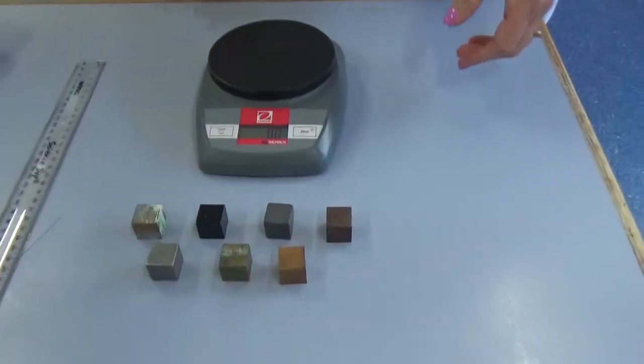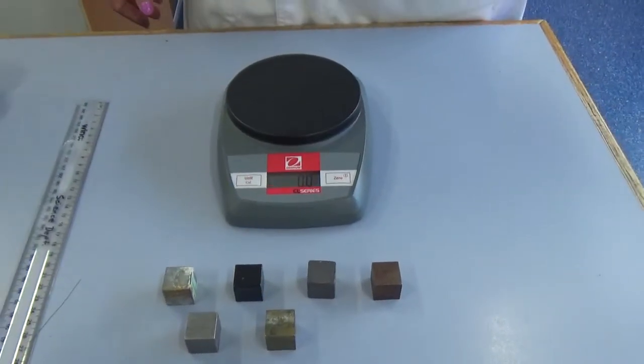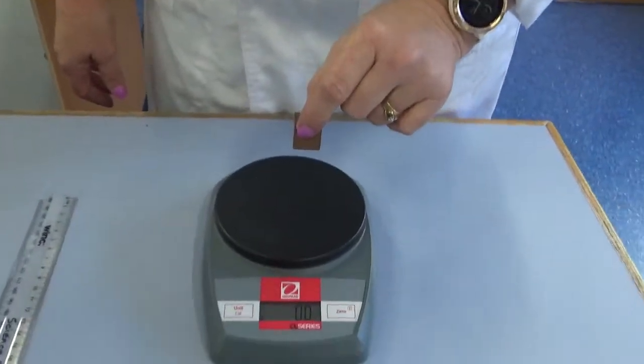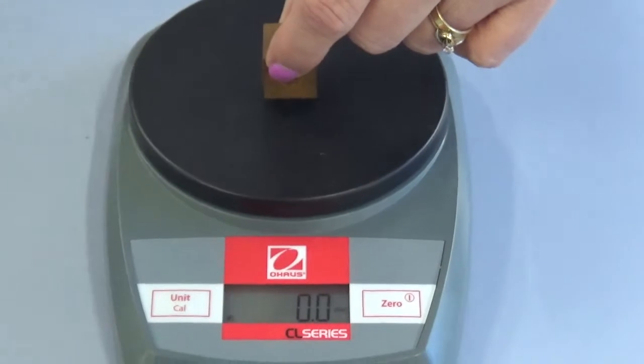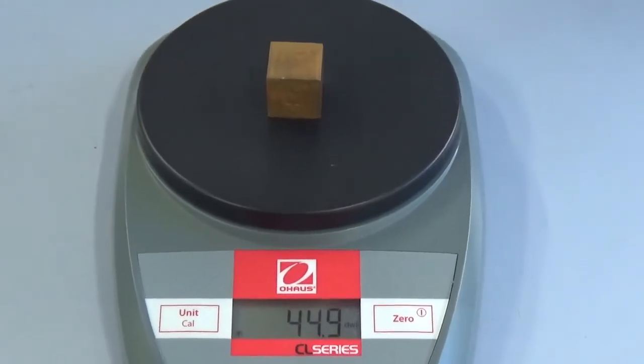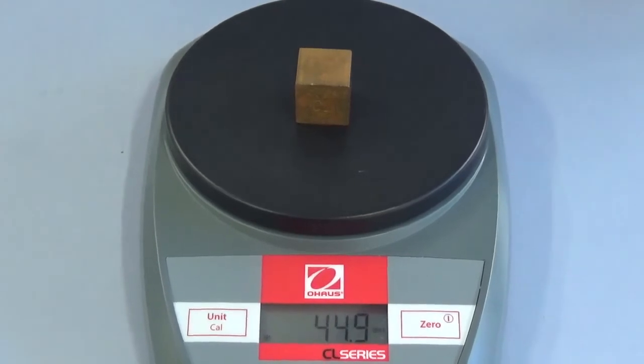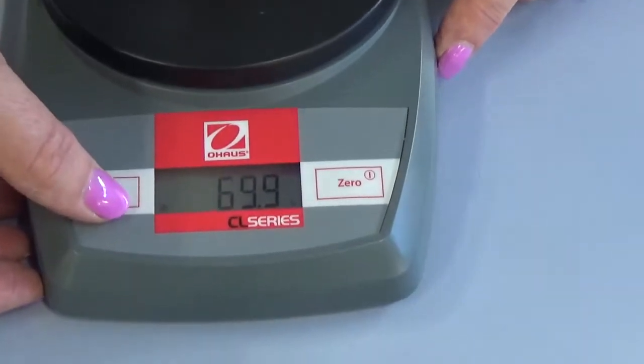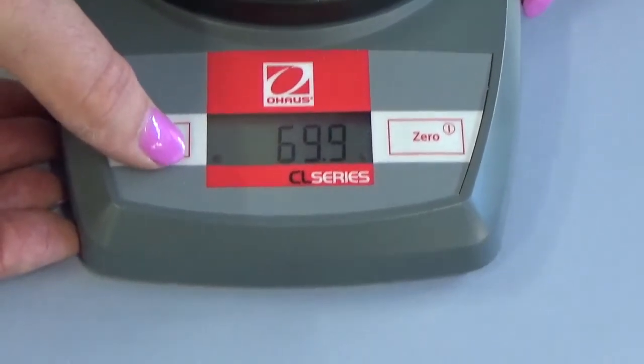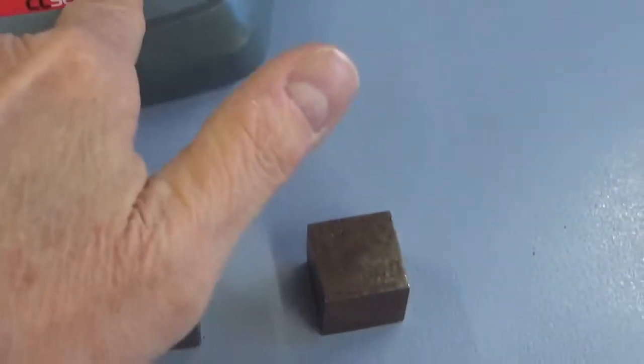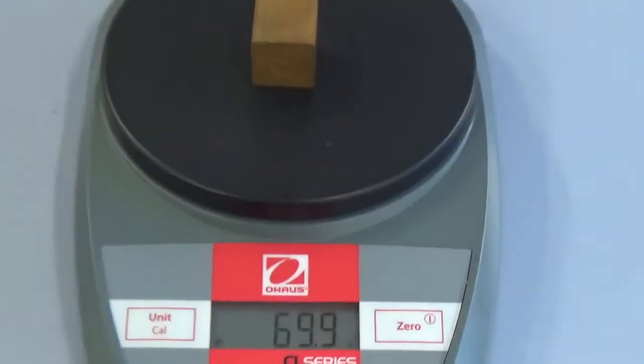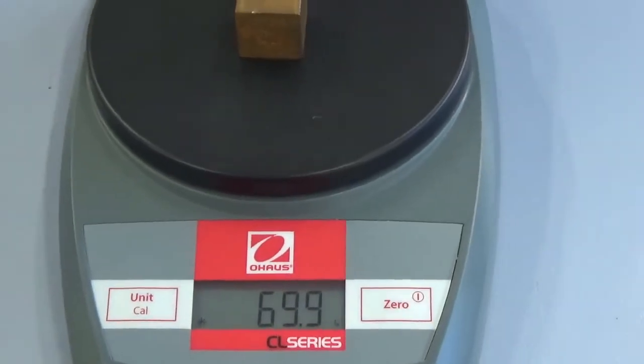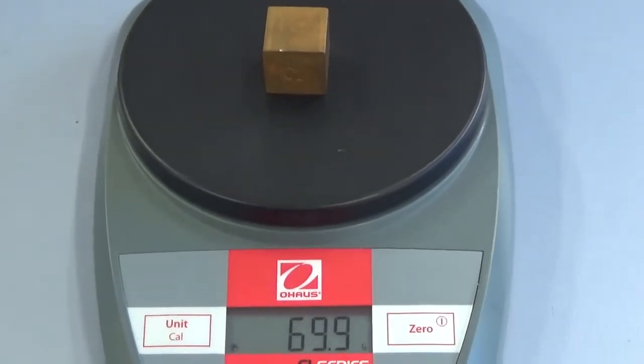Alright, what we're going to do now is weigh all of these density cubes. So this first one that I measured is a cube of copper. So let's have a look at the, put it on the balance and see what the cube of copper weighs. 44.9 grams, I think that's on grams isn't it, maybe not, let's check. Now we're on grams, sorry 69.9 grams, write that down on your sheet.